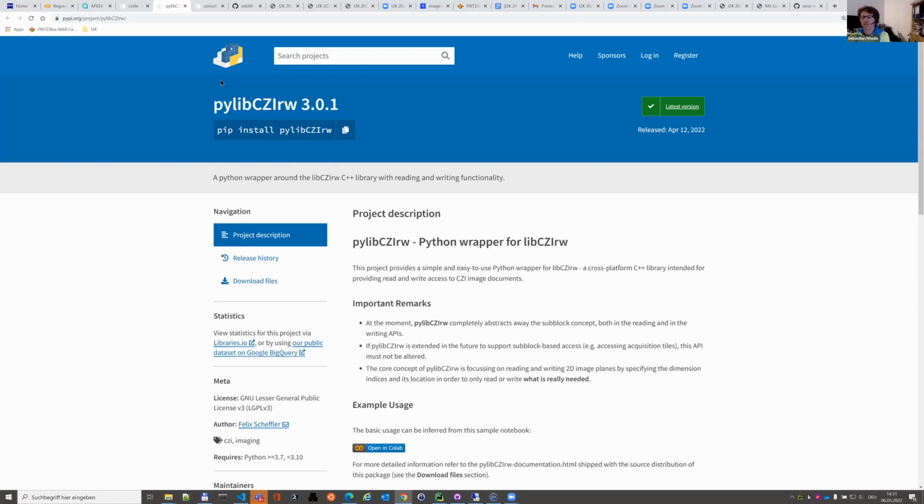So as probably some of you know, reading a CZI actually can be done in different ways outside of our Zen software. Probably the most popular way is using Bioformats. CZI is an open data format. So if you go to our webpage, search for CZI, you can register, and then you will get a download link, and you get some examples and also the internal specification of the CZI file format. So everybody can have a look here.